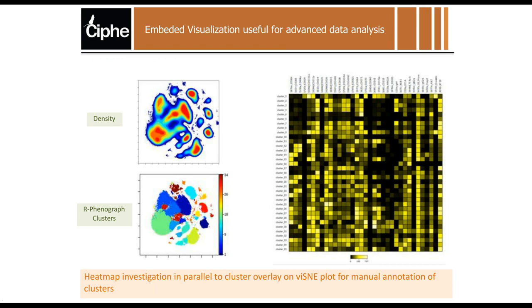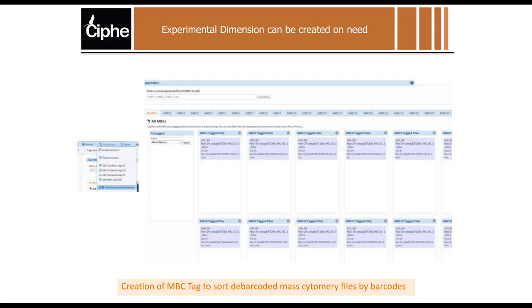And the final thing, you can do basically a crosstalk between different visualizations. For example, here I have one question. I have made clusters. I can visualize the expression of markers on a heat map in Cytobank, and then I can also project this information onto a t-SNE map so that I can relate where are my cells that express this and this marker. This could be the cell type, and then I relate that to a density plot that is shown on the upper part of this figure. That's basically linking these three visualizations, which allows you to have an understanding of what's going on in your sample and to drive this information efficiently to your partners.